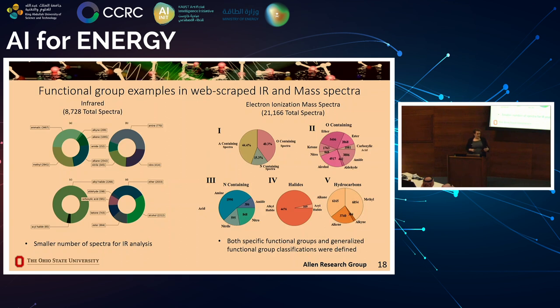However, one of the things that we want to stress is that this could be any kind of chemical characteristic that you have the ability to identify and label within your data. Functional groups was just an easy way for us to get that process started, look at things with a bunch of chemical diversity. They're going to have different fingerprints, both in mass spectra and the vibrational spectroscopy.